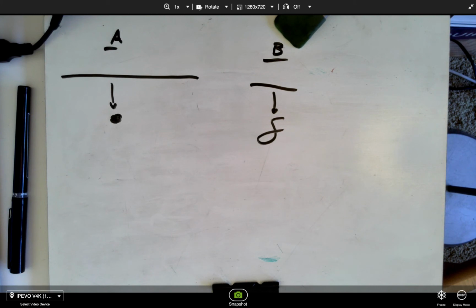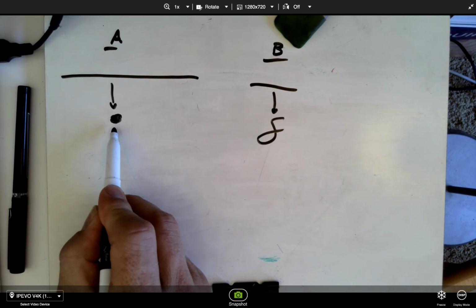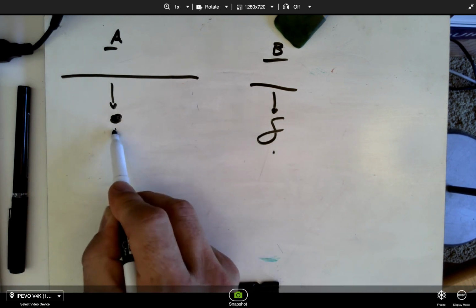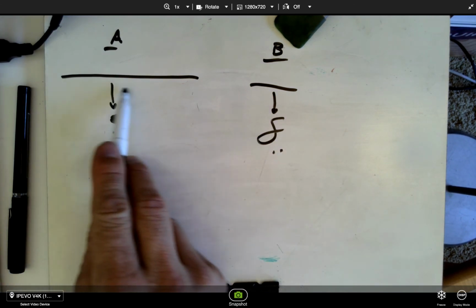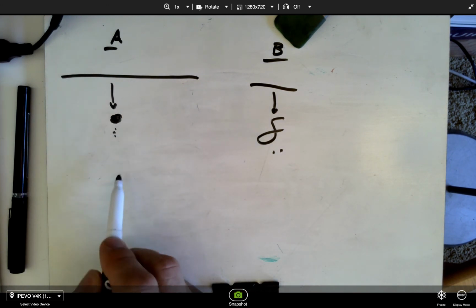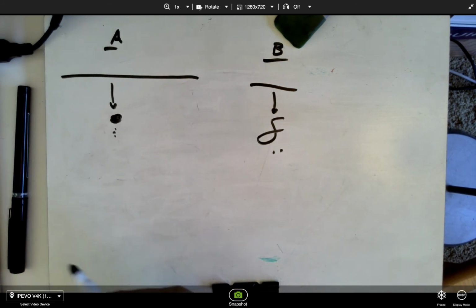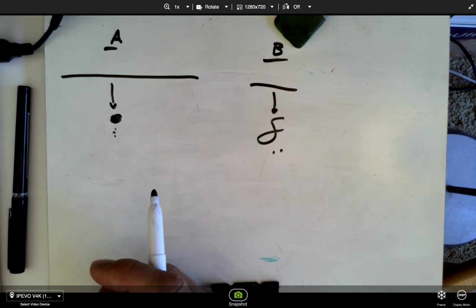Now, when we run these proteins through a gel, and we don't do anything special, which one of these proteins is going to run more quickly, be able to get more quickly through those pores? A or B? It's going to be A. A is going to be able to, even though it's technically the larger protein, because it's so compact in its native state, burn through that gel faster than B. And if we didn't know this about the difference in their native structure, we would think that A was the smaller protein because it ran through that gel more quickly.